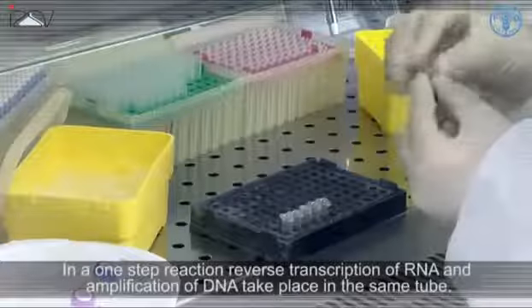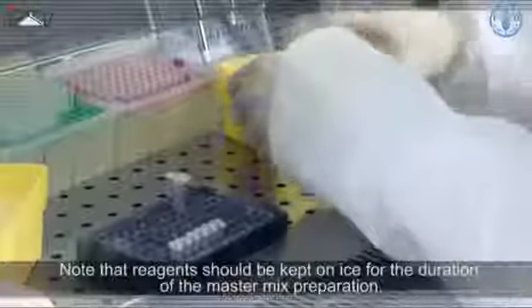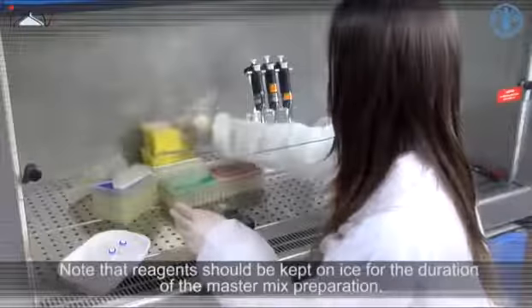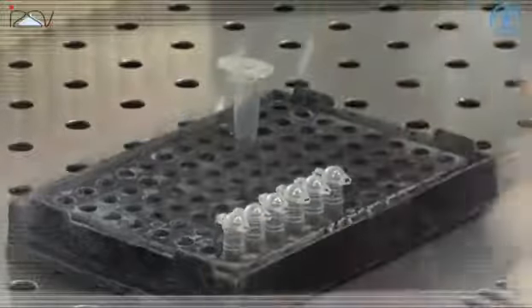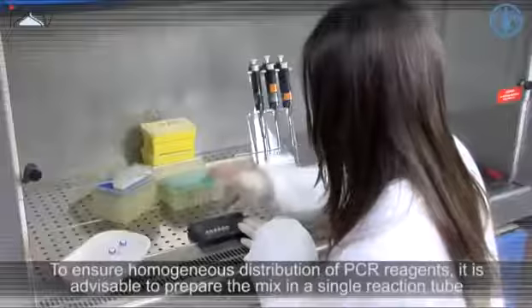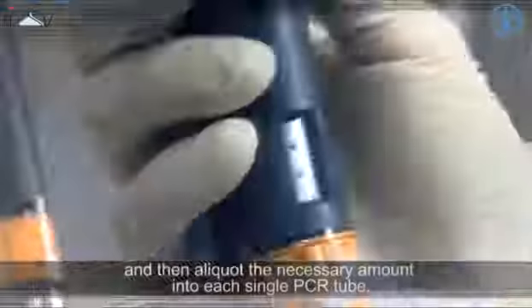In a one-step reaction, reverse transcription of RNA and amplification of DNA take place in the same tube. Note that the reagents should be kept on ice for the duration of the master mix preparation. Prepare and label sufficient PCR tubes for the number of samples to be tested. To ensure homogeneous distribution of PCR reagents, it is advisable to prepare the mix in a single reaction tube and then aliquot the necessary amount into each single PCR tube.